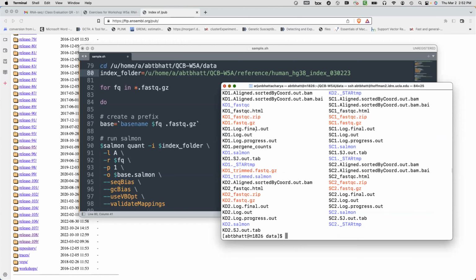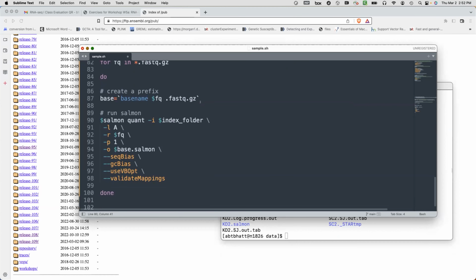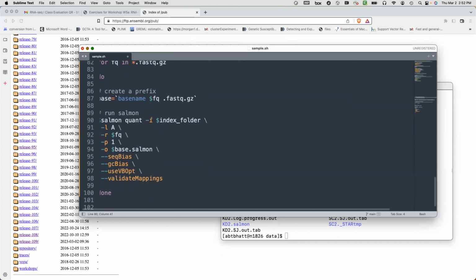We quantified, for me, 5 files in about 20 minutes, and we did it serially with one thread. Now you can run this with multiple threads and parallelize parts of this loop, so it'll be way quicker than STAR can ever hope to be.